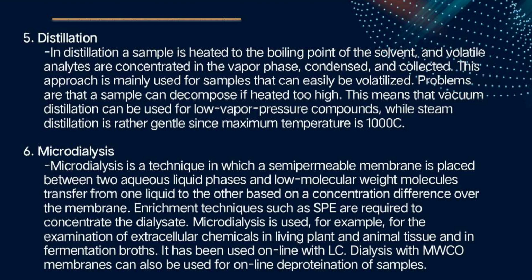The process of distillation exploits the difference in the boiling points of the components in the liquid mixture by forcing one of them into gaseous state. And also note that distillation is not a chemical reaction, but it can be considered as a physical separation process.